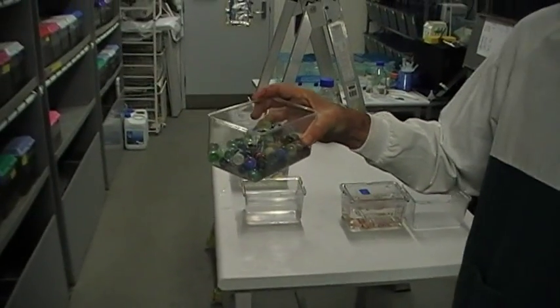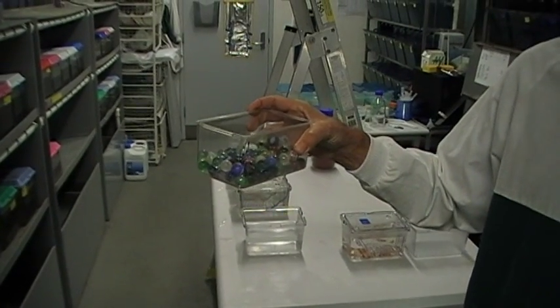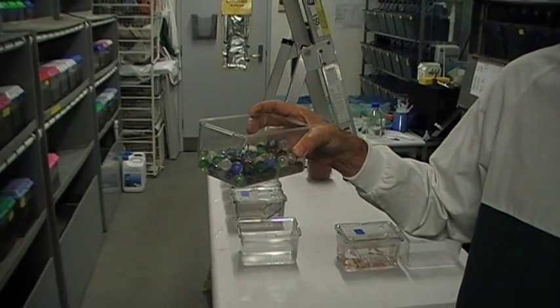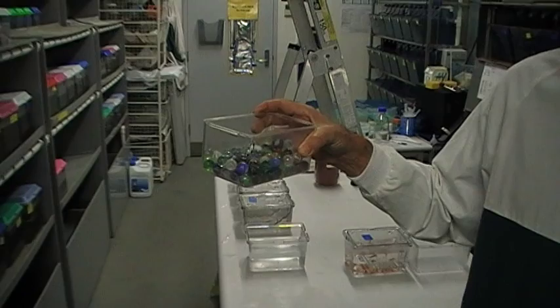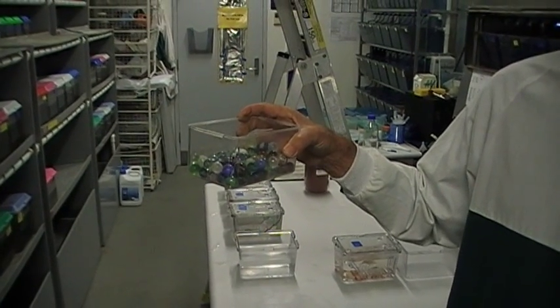Well, if you look here, we can see a little box of marbles. To the zebrafish, these marbles look like river stones and the zebrafish like to lay their eggs over river stones.